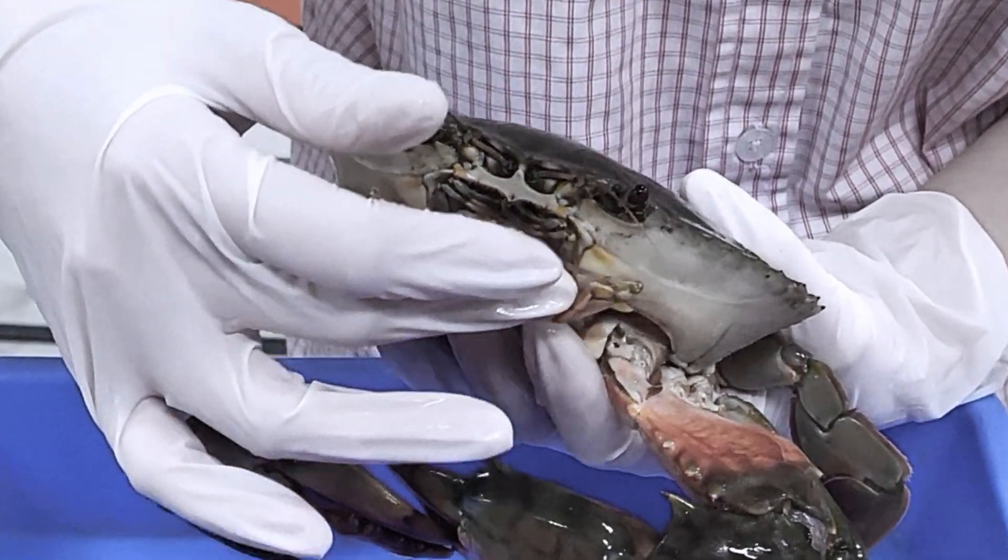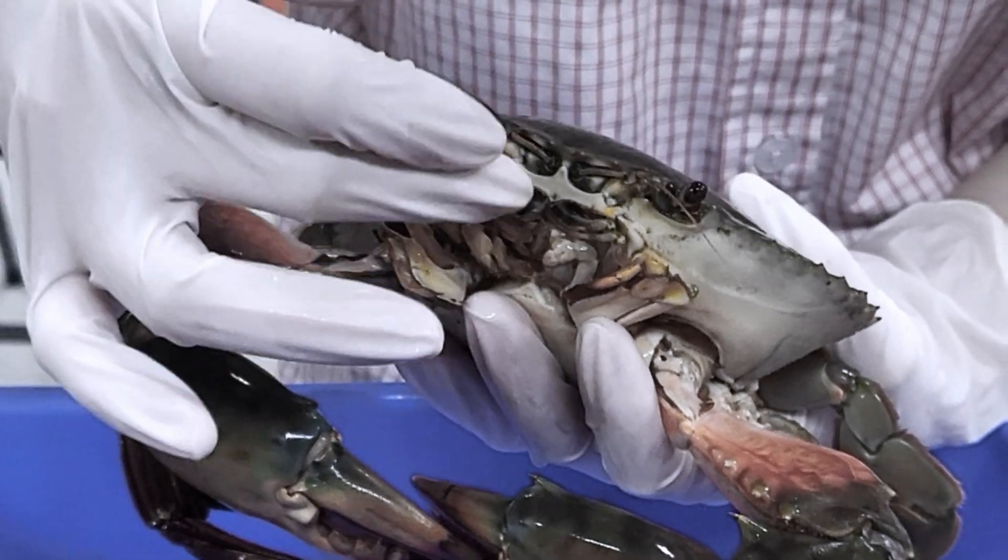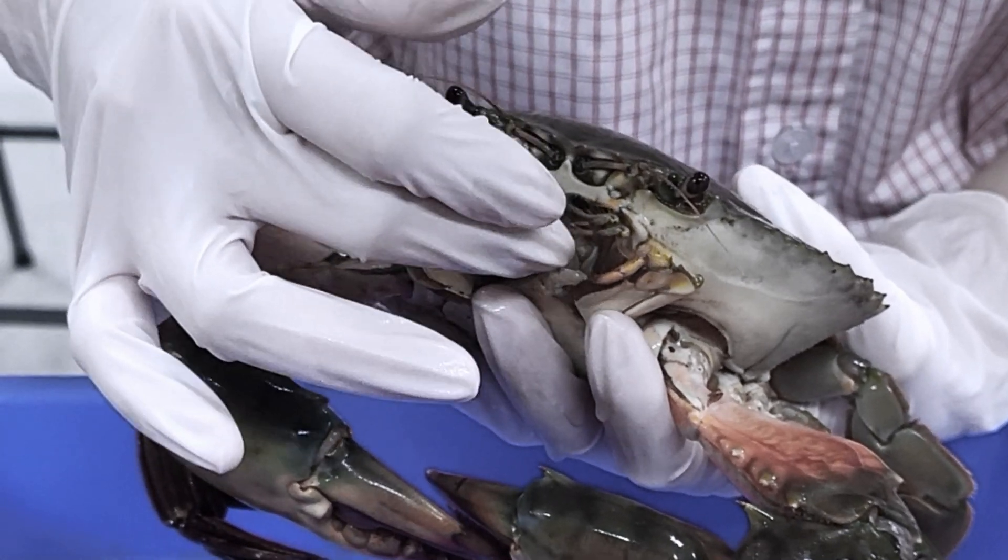Moving to the mouth part, a maxilliped is one of three pairs of mouth appendages on a crab's head that are designed to rummage and bring food to the mouth.